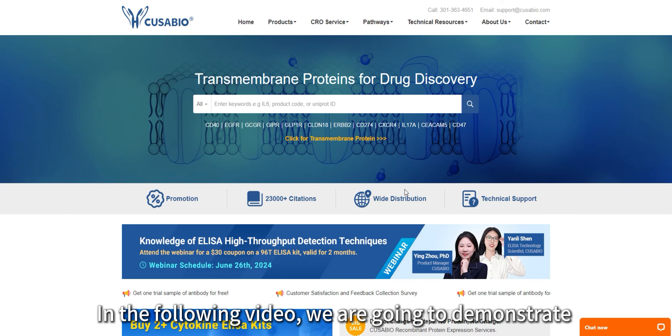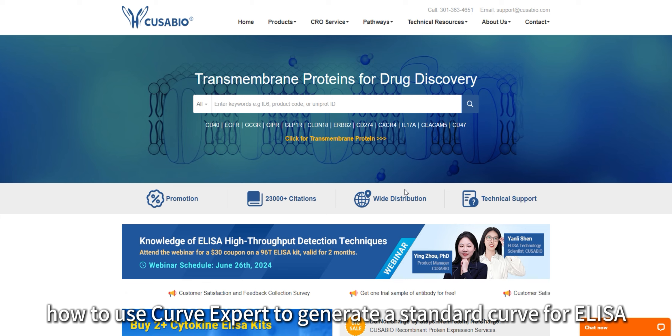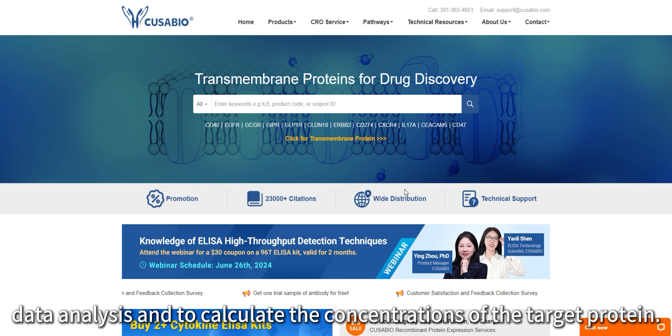In the following video, we are going to demonstrate how to use Curve Expert to generate a standard curve for ELISA data analysis and calculate the concentrations of targeted analytes.